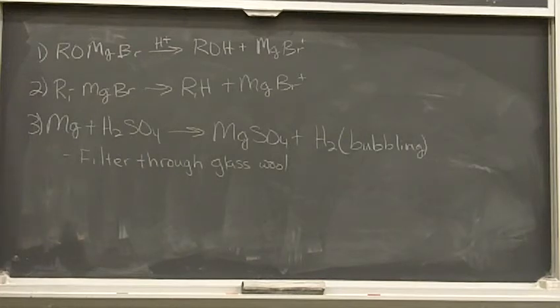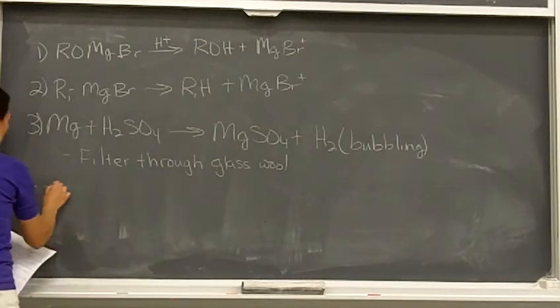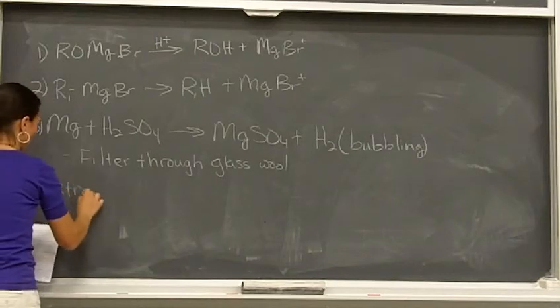Now, there are a couple of things that we're going to talk about here that have to do with definitions for organic lab workups and things that you're going to continue to use. So keep these definitions in mind. You'll keep using these throughout the rest of the semester. One of them is what's called extracting, okay?